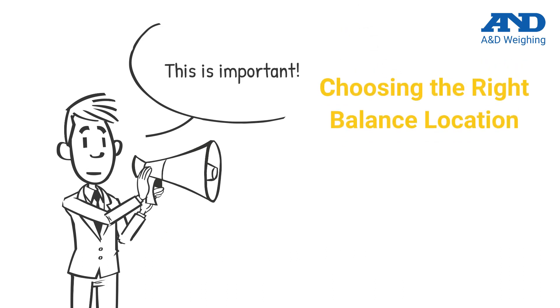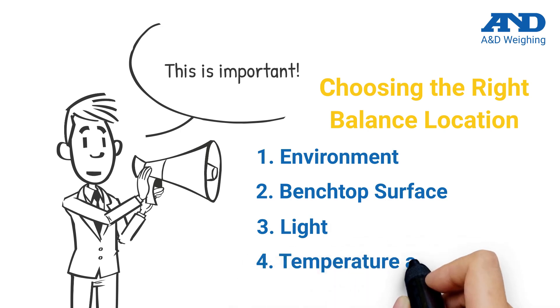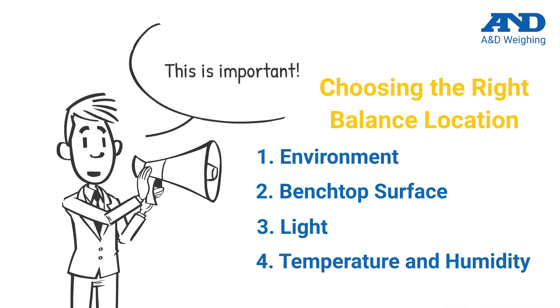When choosing your balance location, consider the following factors. First is the overall balance environment and surroundings. Second, the surface on which the balance is placed must be very stable and free of any vibration. Third, balance placement in the room should minimize sunlight and air currents. Fourth, environmental conditions such as temperature fluctuation and relative humidity need to be considered as well.